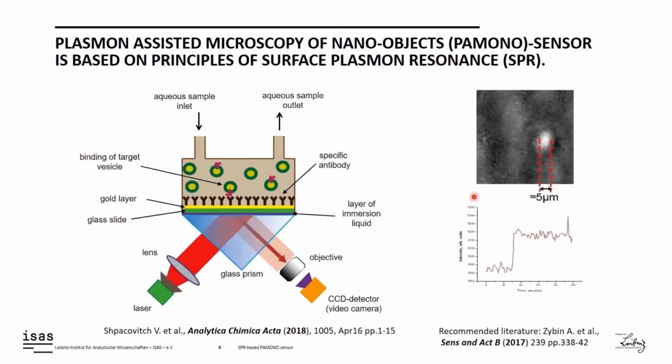I also would like to mention that instead of coating the prism surface with gold or other noble metal, one may coat glass plates with the same refractive index as the prism with a thin metal film. It is better since it makes the substitution of optical parts easier.